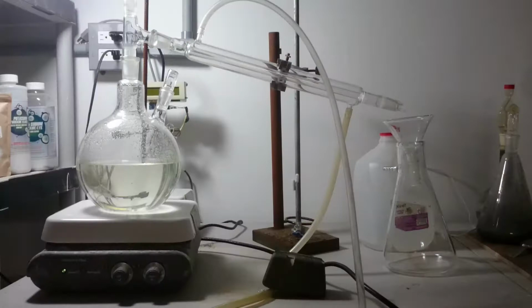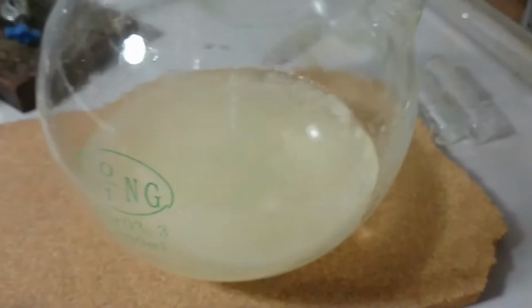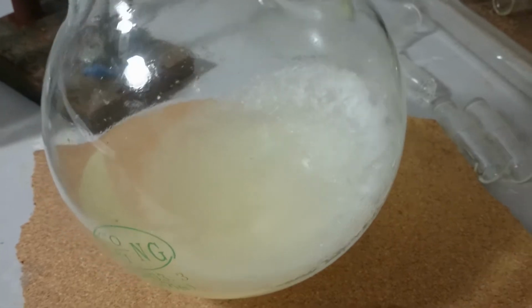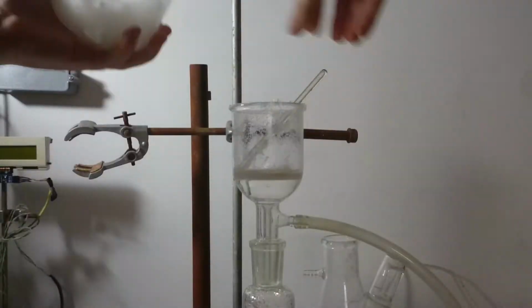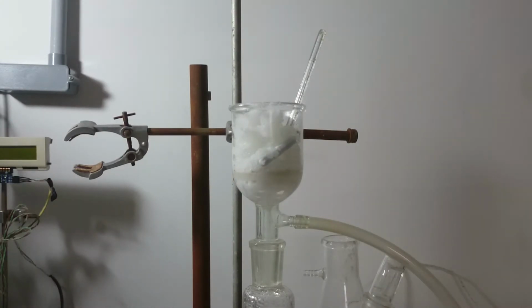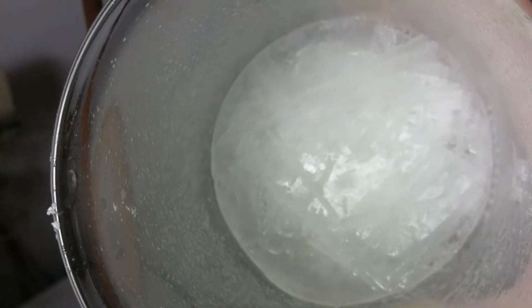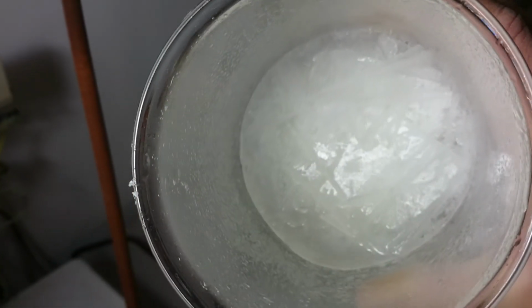Next, I need to boil off the excess water to drive the sodium propionate out of solution. In this case I use simple distillation, but it's really not necessary. You can just boil it off in a flask. Next I vacuum filter off the crystals that have formed and collect the remaining liquid. I have to reboil this and refilter it several times to collect all of our desired product, as sodium propionate has a solubility of about 1 gram per milliliter, which means it's extremely soluble.